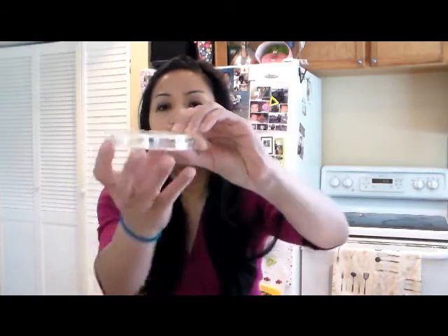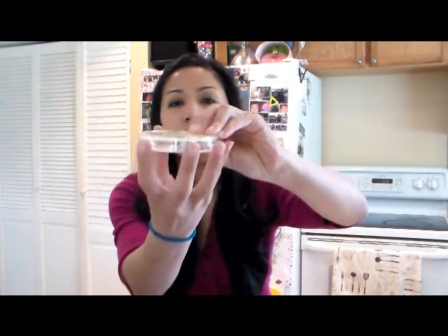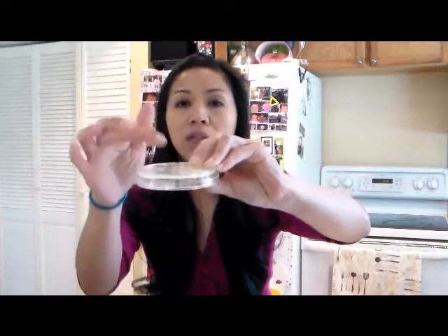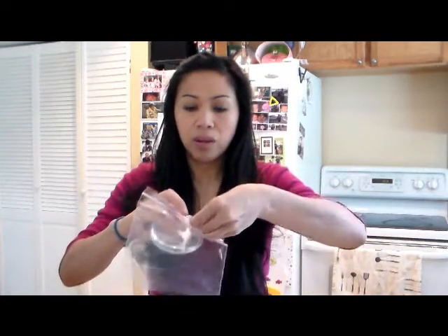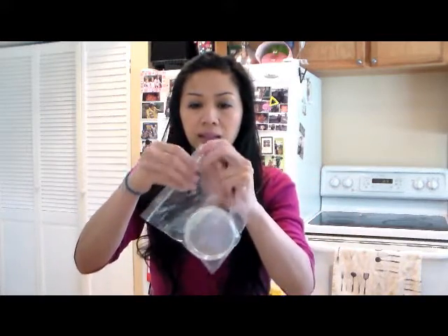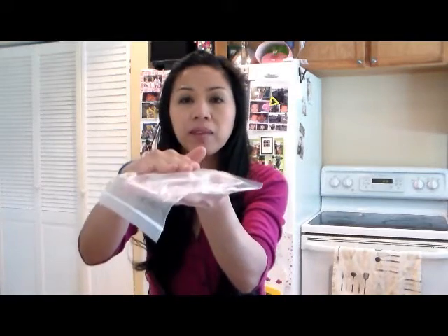To grow the bacteria, place your agar plate upside down so the lid is on the bottom. That way any condensation will collect in the bottom and won't get on the agar itself. You can put it inside a Ziploc bag, seal it tight, squeeze the air out, and then place it upside down.